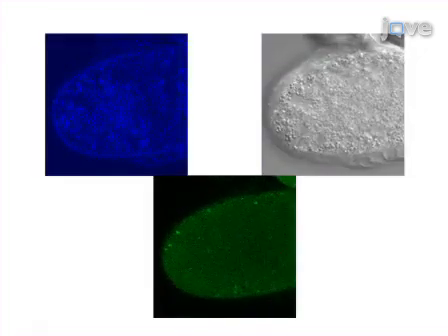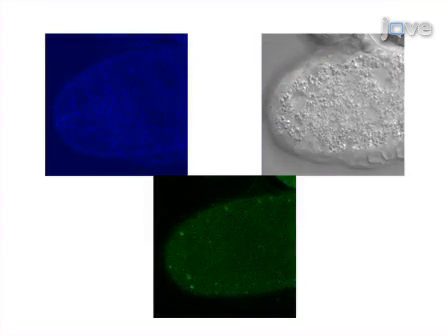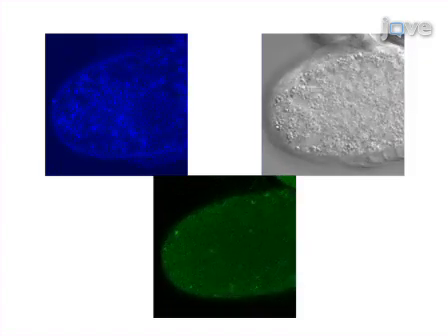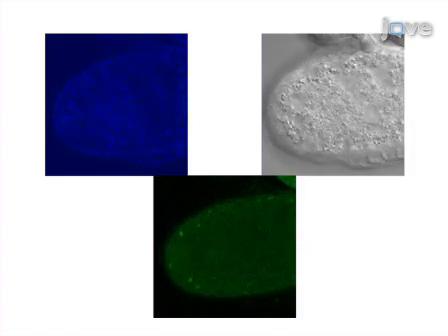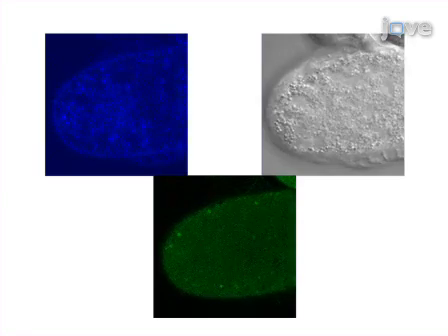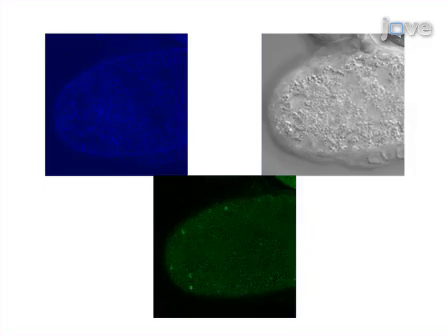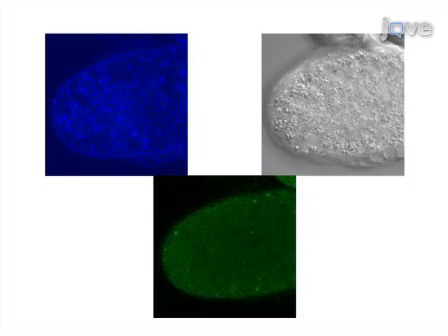This embryo was injected with lysotracker blue and expresses GFP ubiquitin. The images were collected using a 63x 1.4 NA lens with 488 and 555 lasers set at minimal power and maximum gain. Typically, Z-stacks are collected every 10 to 15 seconds for up to 60 time points before photobleaching occurs. For this time-lapse video, the Z-stacks were collapsed into maximum projection images.